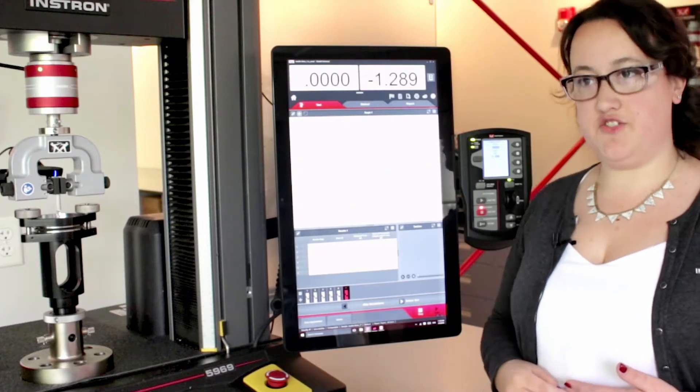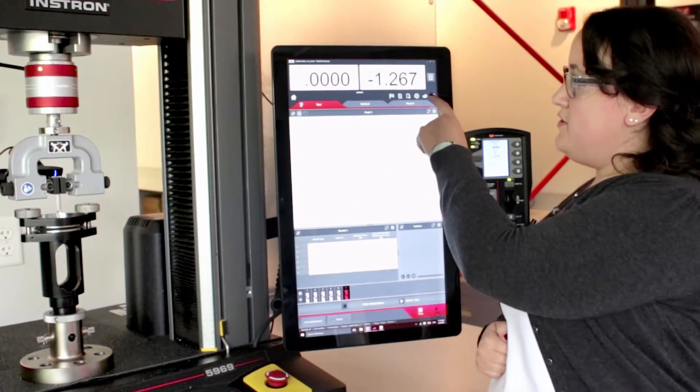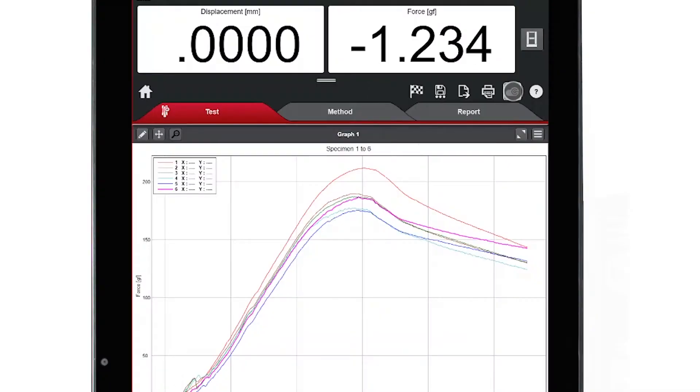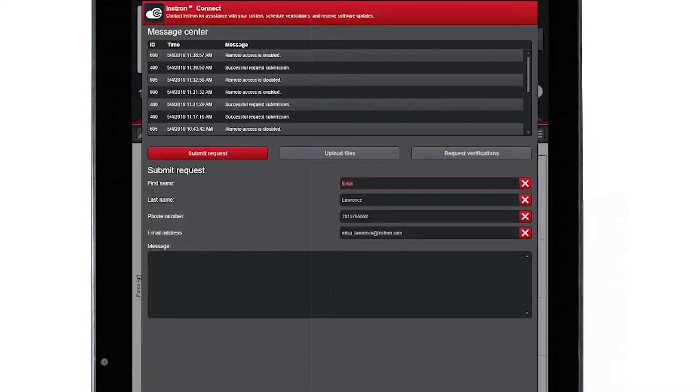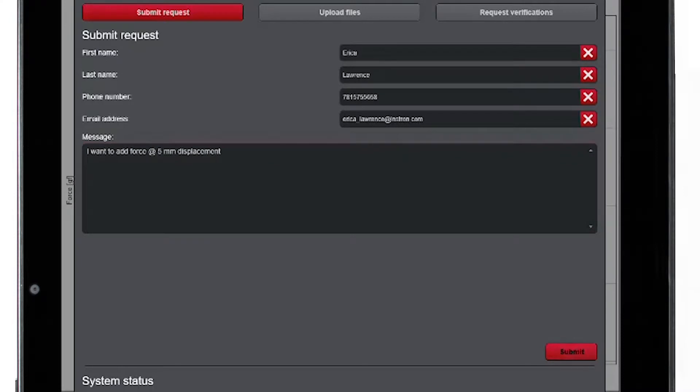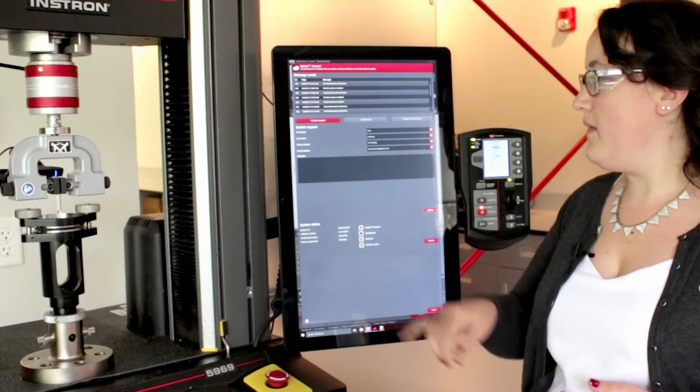If I need help from Instron tech support, I have this new feature called Instron Connect at the top of my screen. Here I can give basic contact information, as well as a short message of whatever I may need help with. I press the submit button and send this off to tech support.